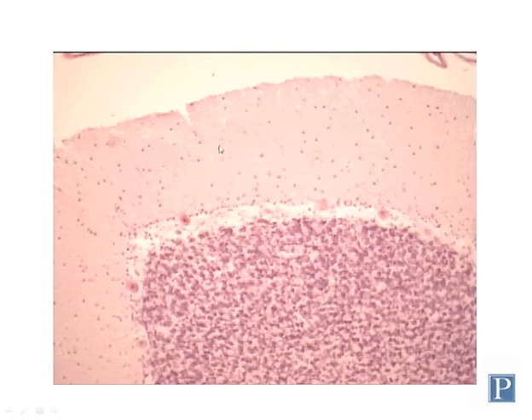Mostly this layer contains dendritic processes from a special type of neuron called Purkinje cerebellar neurons, and those are located in another layer. This layer right here, which is called the Purkinje cell layer, contains the cell bodies of the Purkinje neurons, which you can see right here.